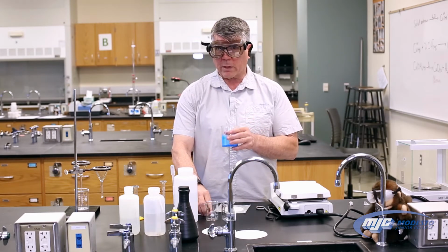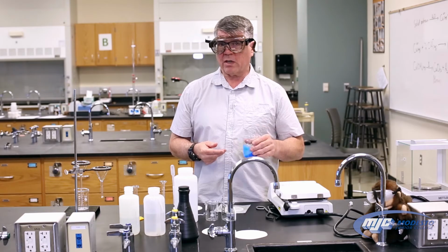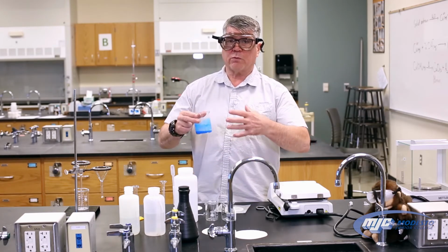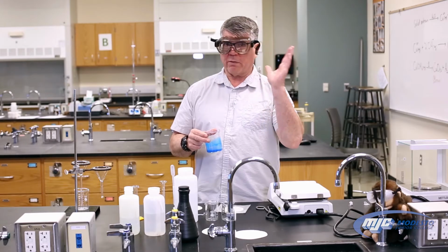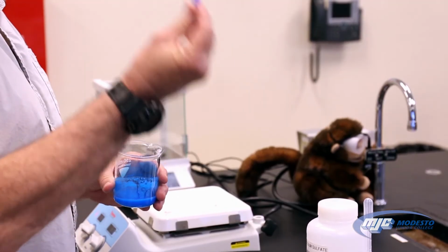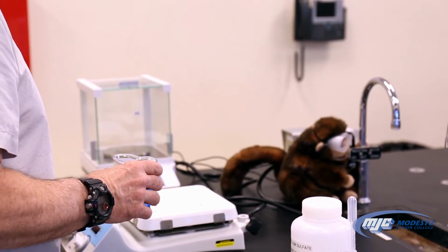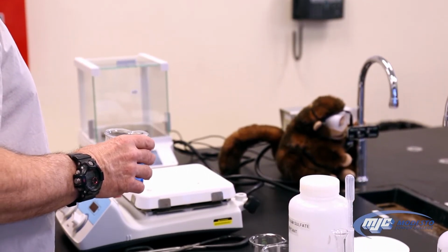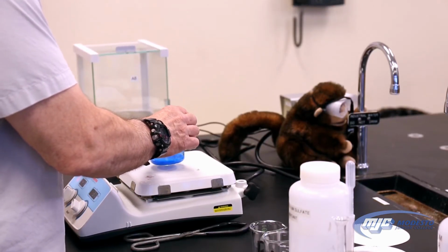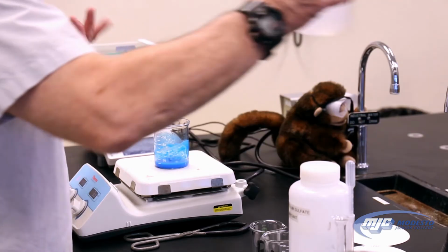Now, we have to be really careful with this because this stuff's pretty dense. And if we just stick it on a hot plate and let it go, what happens is we get these bubbles forming under there, and then when they burst, they throw stuff everywhere. I mean, it's hit the ceiling before. So to avoid that, we're going to take a magnetic stir bar, pop it in there, and put it on the hot plate. As long as it's stirring, it should not bump, pop like that.